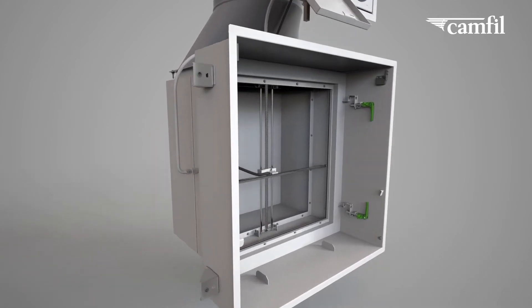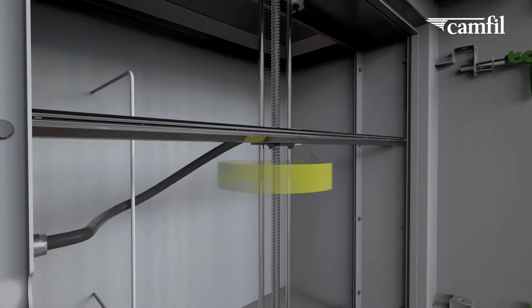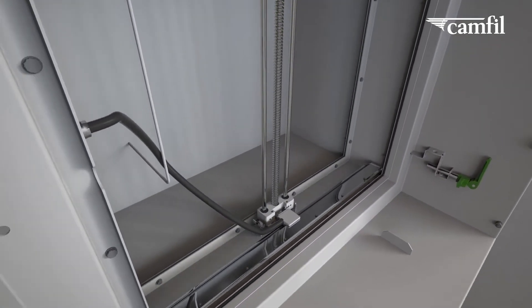The manual integrity probe allows for an easy, room-sided, non-intrusive filter validation to ensure optimized system performance.